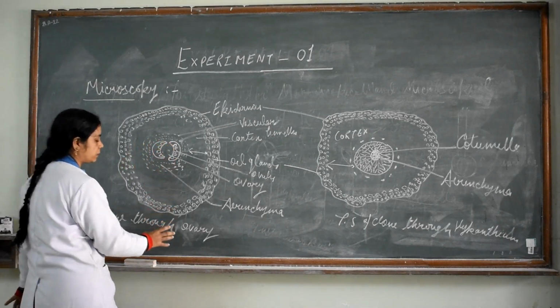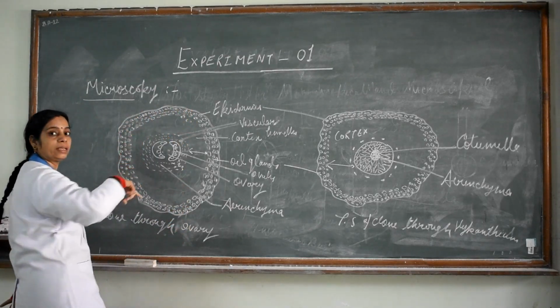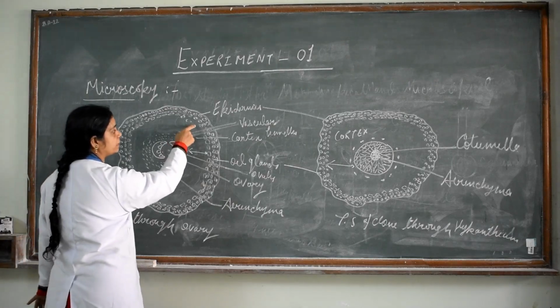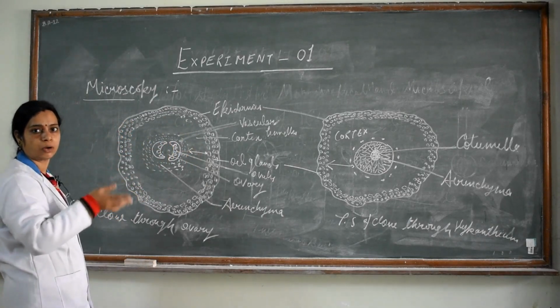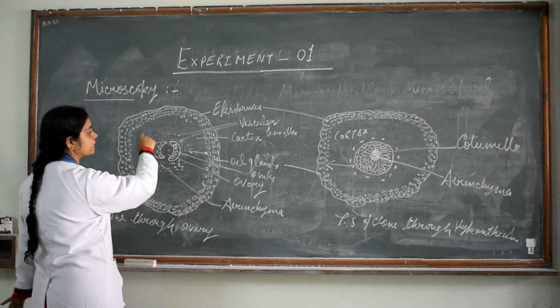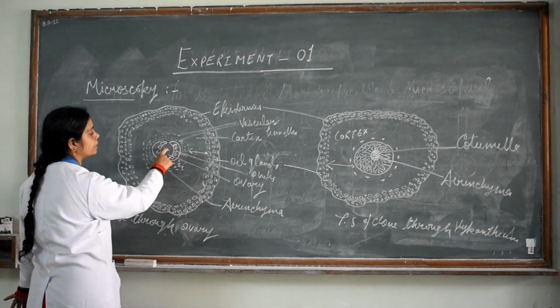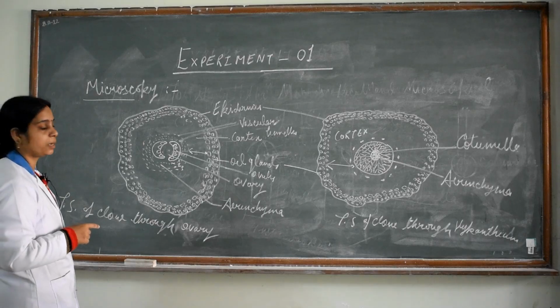So in the section through the ovary you are going to observe the epidermis, oil glands, and in the oil glands, oil is present. Clove contains at least 15% clove oil. After that, this region is not blank. This region is called the cortex. Cells are present, but we have not shown them because they are normal, usual cells. The special cells are the three concentric layers of vascular bundles above the ovary, and in the ovary ovules are present. This center portion is not blank either. Cells and tissues are present here also.